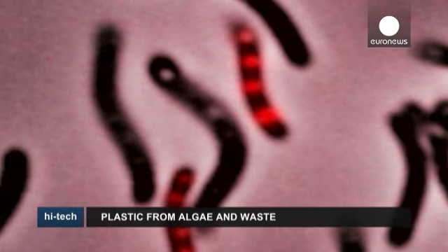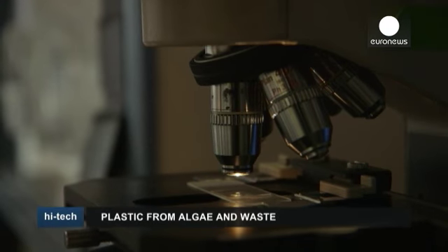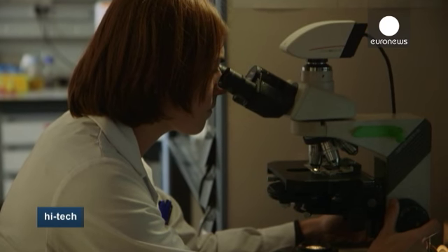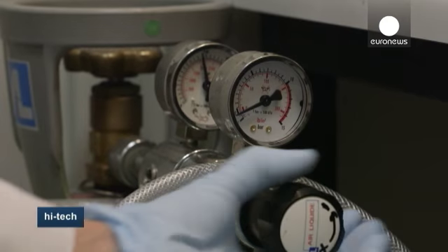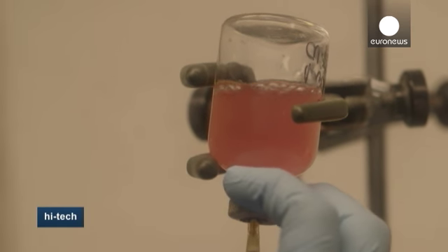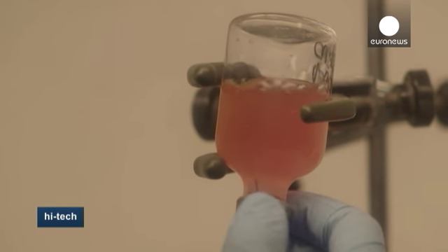At the Biological Research Centre in Madrid, Spain, scientists are looking at the role bacteria could play in plastics production and making polymers out of organic waste. And no petroleum needed. Here, they're growing the bacteria which are key to the whole process. This is part of the pan-European research project SynPol, which is named after a specific gas mixture which triggers the production of bioplastics inside these microorganisms.